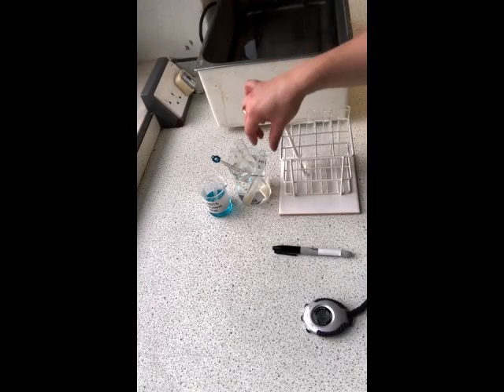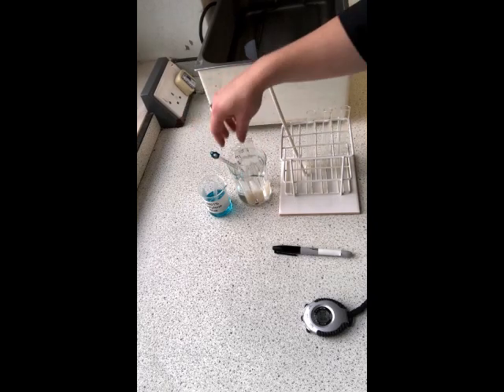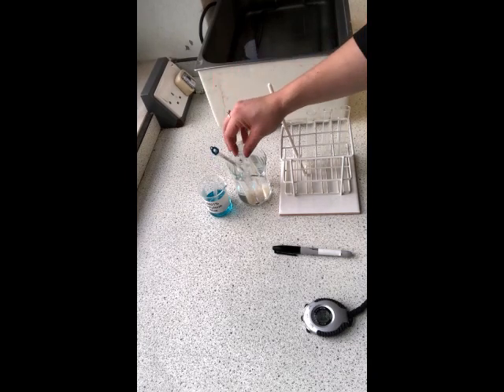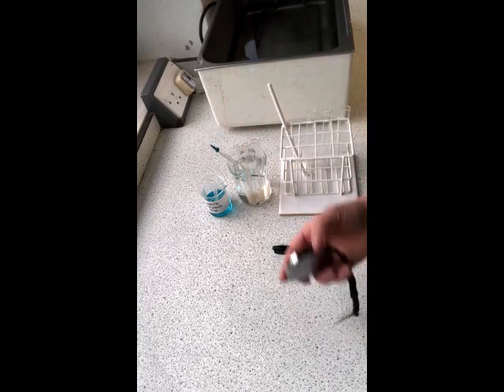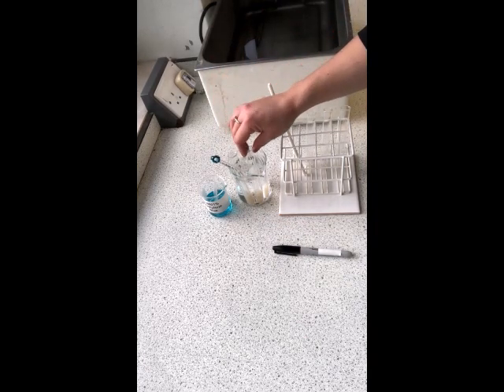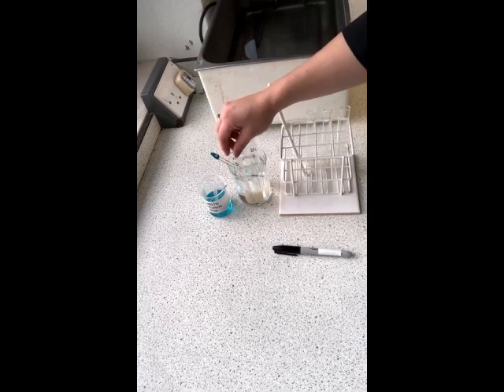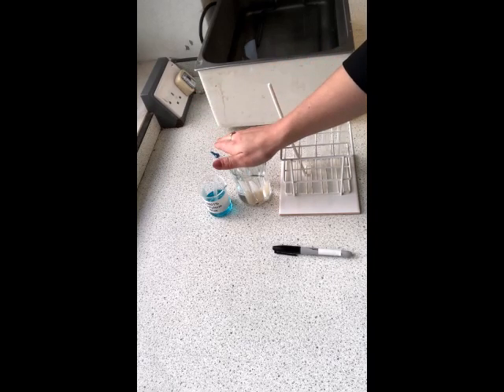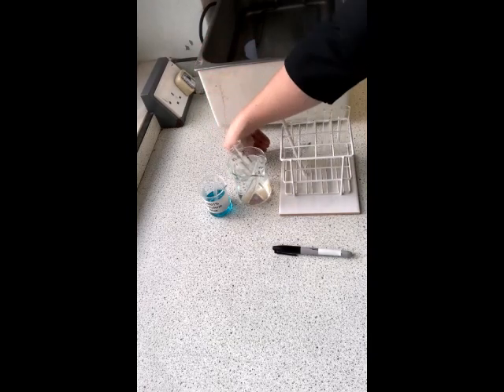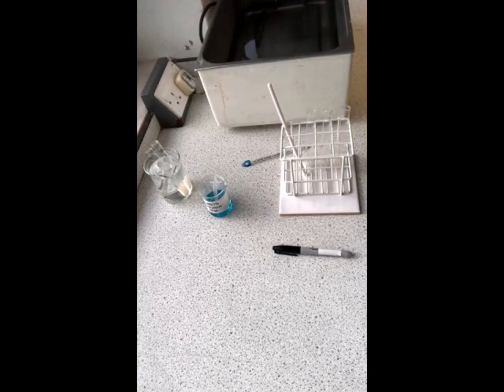Welcome back. So in that pause, I have repeated this for all 3 tubes, and hopefully you can see that the result is that it has indeed gone colourless. So the time taken, roughly we had 220 seconds for tube 1, 236 for tube 2, and 219 for tube 3. So we'll be able to work out a nice average for that. Okay, so now we are going to move on to our second round of experiments.